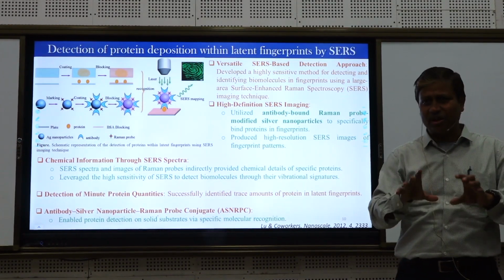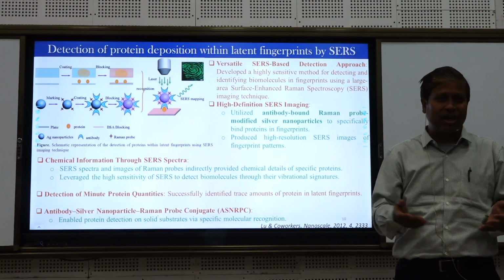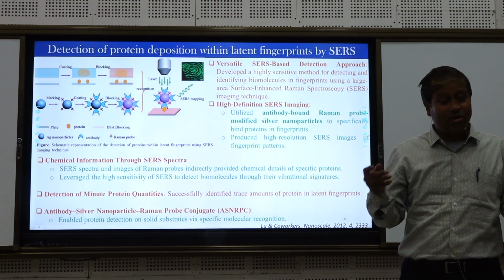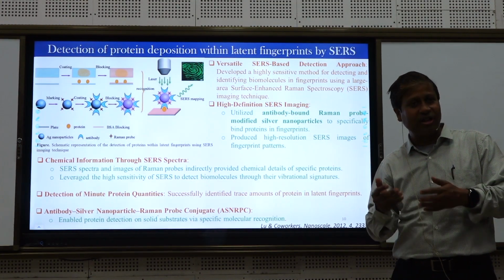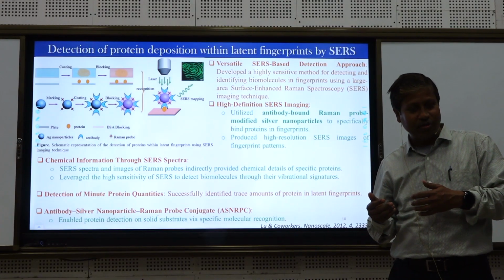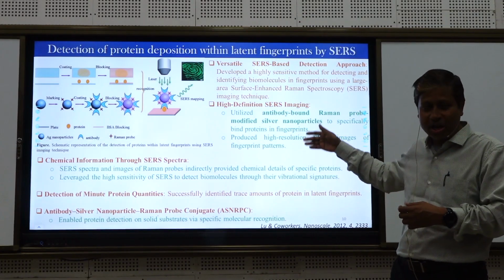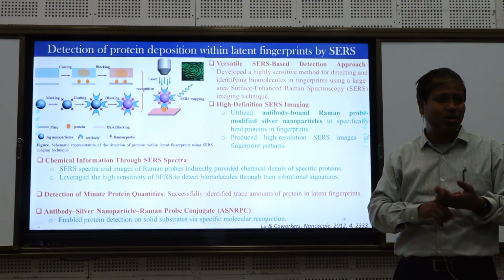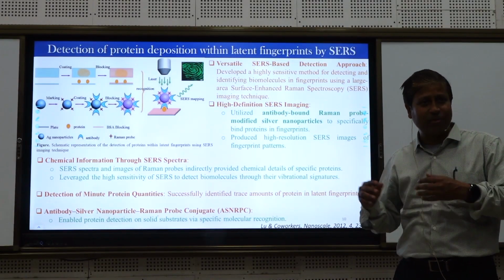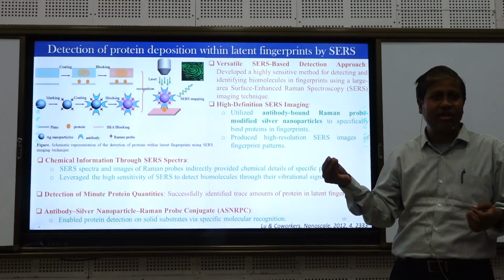In many cases you will see that the spectrum change is so small that apparently you feel like there is no change. So those groups devote themselves to finding some numerical method, how to get data from that. There are many numerical and statistical methods, because for this kind of forensic or medicinal work, you cannot just publish, telling that this is a cancerous cell, just because of 1 or 2 studies.